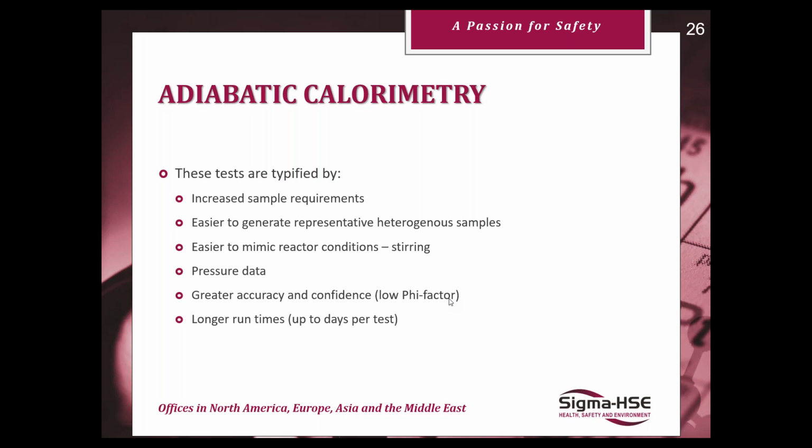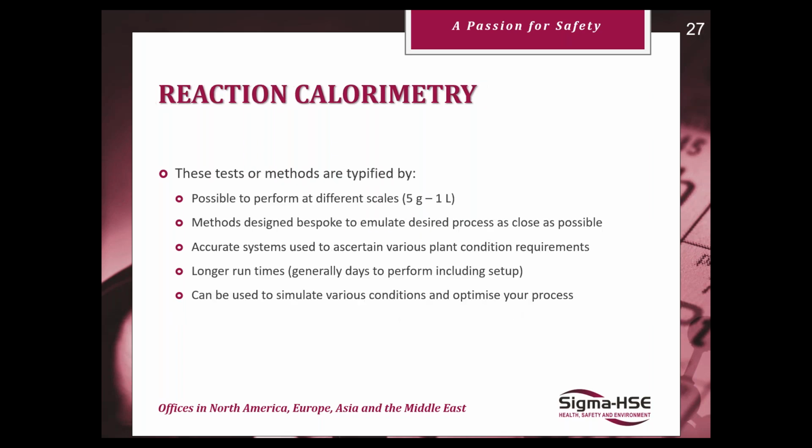But again, these are not screening tests because they can take days to run per test with setup time and analysis. Yeah, so there's a bit of a trade-off there. And all of this data feeds into when we're evaluating a whole chemical reaction process, the reaction calorimetry.